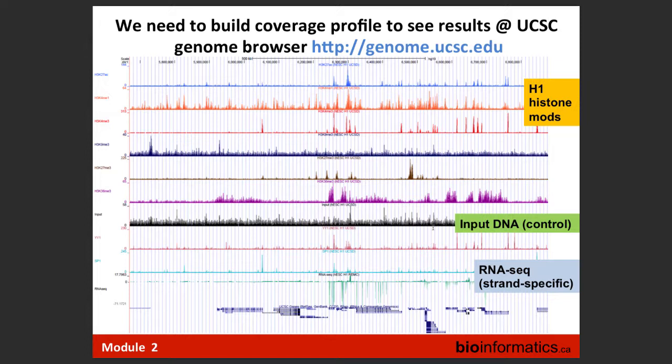We can do some normalizations, but let's talk about normalizations a little bit later. It will never help us 100%, because in order to normalize properly, you will be asking: should I normalize on the background reads or on signal reads? And if I normalize on total, what is the signal to noise in my library? So many things. But what I can do is look at my track and see: are my peaks distinct from my background? If they are, then my library is okay.